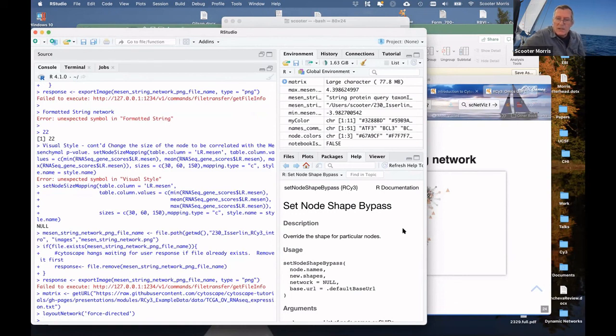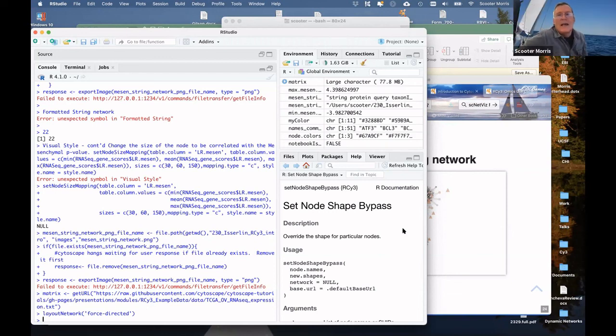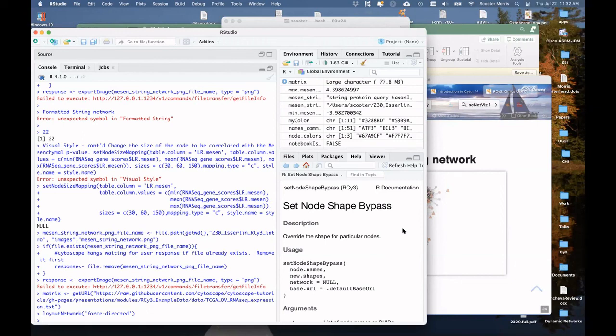Yes, so the curl is not working on my machine. Maybe it is one of the dependencies. I need to upgrade it. So when I install the RCY package, they said you have to upgrade these packages. Then I just say no. Oh, okay. Yeah, I would definitely say yes. But if I upgrade it, it will crash other things I'm doing. I'm using only a specific version of the package. I cannot upgrade them.